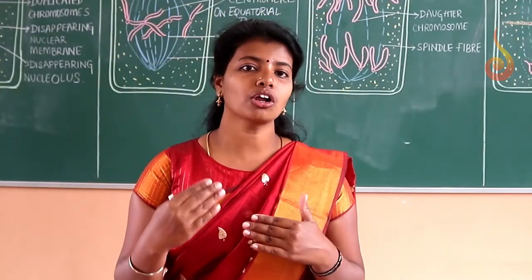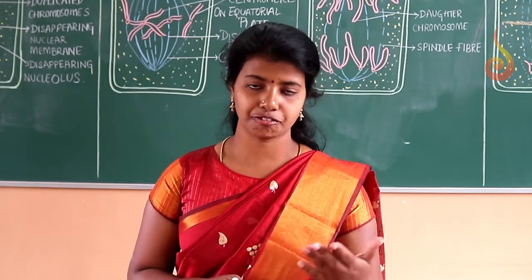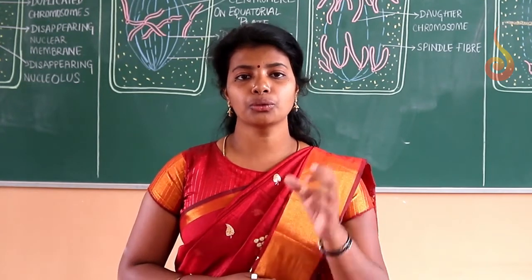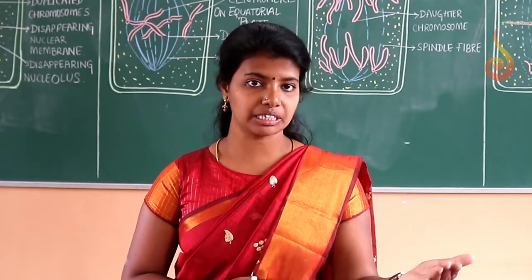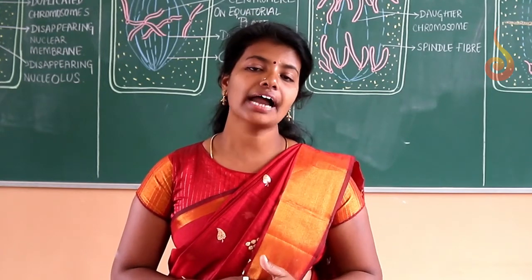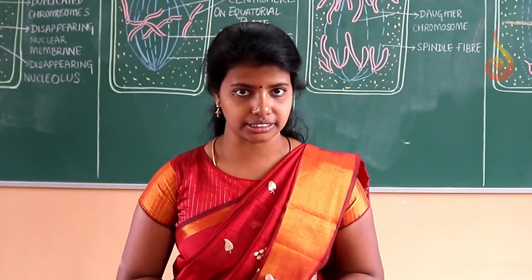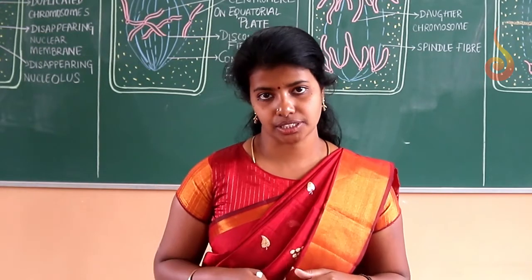So I hope all of you have understood the introduction to mitosis, what I have told. So you know what is mitosis, in which type of cells we could see mitosis, what is the significance of mitosis and what are the stages of mitosis. Now, what is the aim of today's experiment?